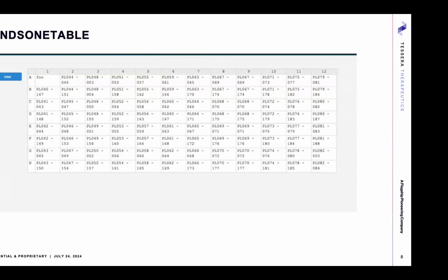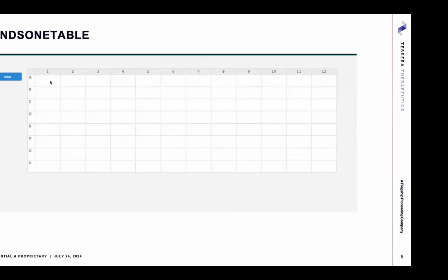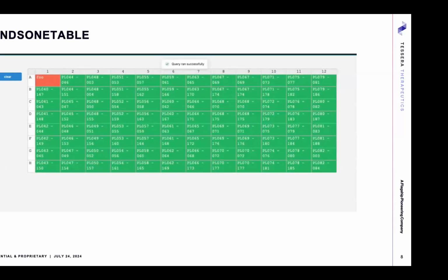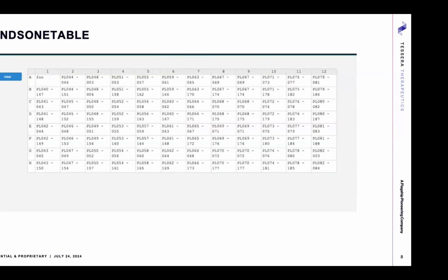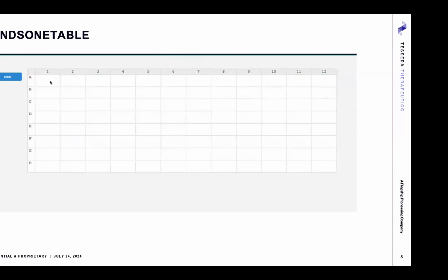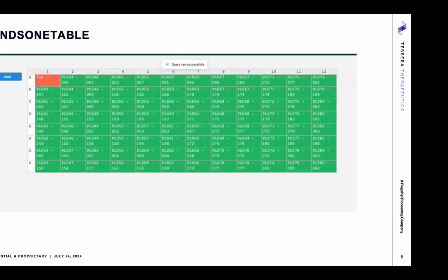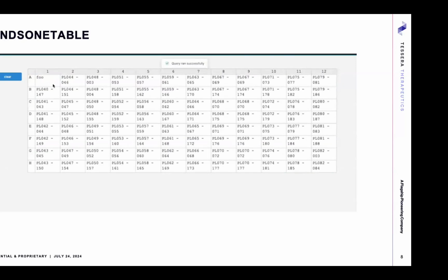So if we're adding 10 plates of something, they want to plate it all out and see how it all looks. They can upload an Excel file into one of the user interfaces, and it does this transition. If you see the transition from white to green or red, every one of those is a callback to Benchling to validate that those are real entities and that they're the right type of entities for this type of workflow. So it gives you a visualization of you doing the right thing.